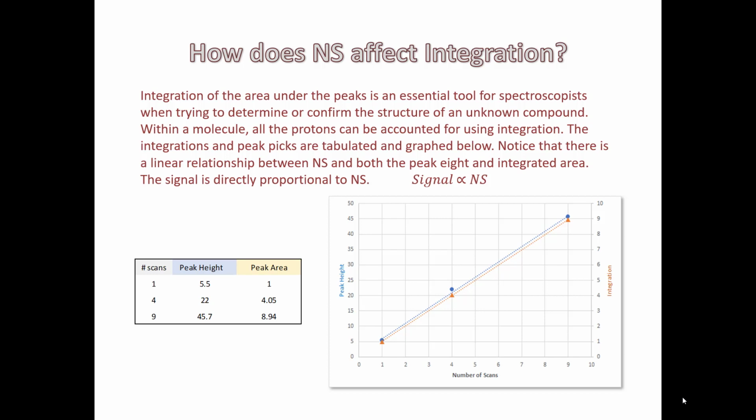Notice here, though, that there is a linear relationship between number of scans for both the peak height and the integrated area. The signal is directly proportional to the number of scans.